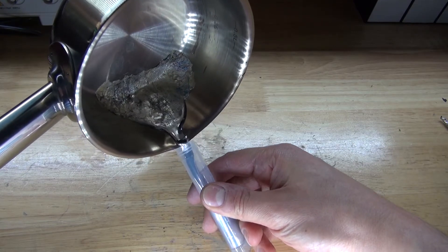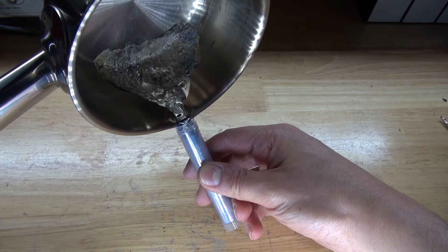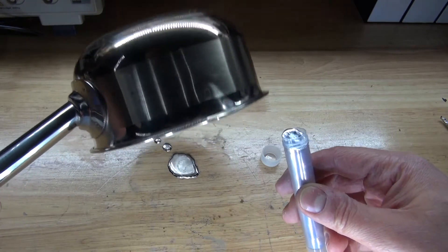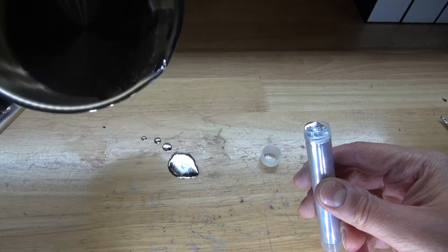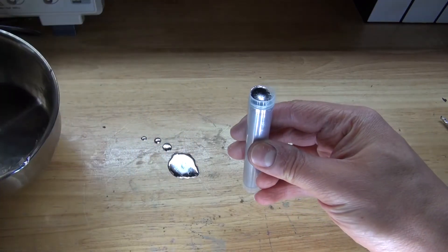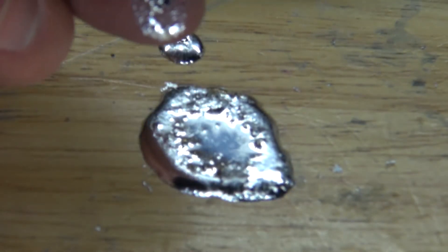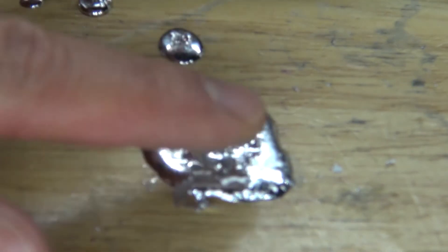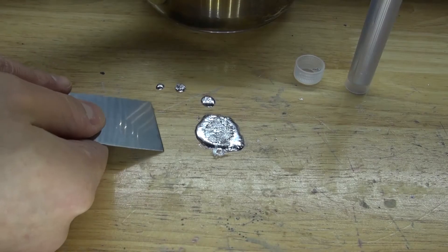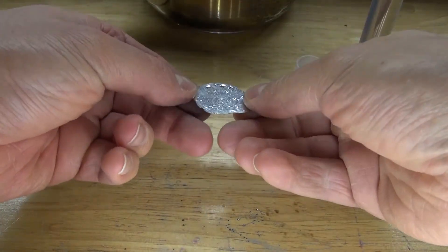There we go — the nice shiny metal, exactly what I hoped for. It looks like I have too much. The rest right here is most likely the oxide. It's a little hot but it crumbles off like that. And here's the Fields Metal. Beautiful.